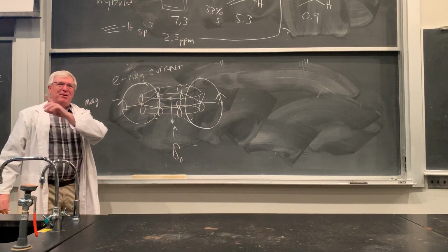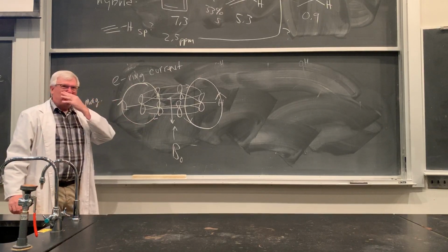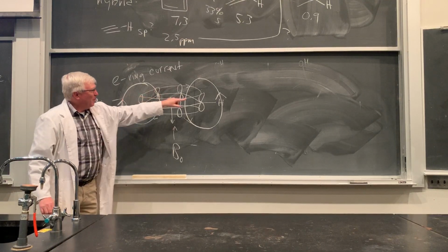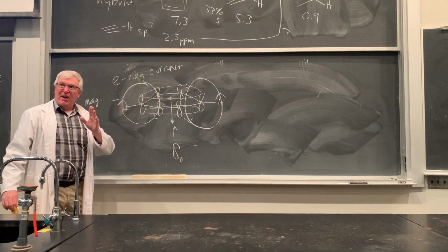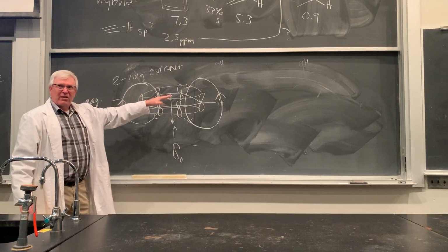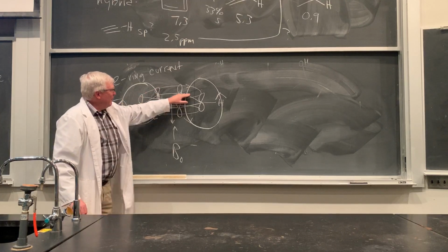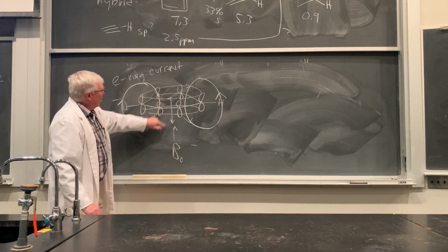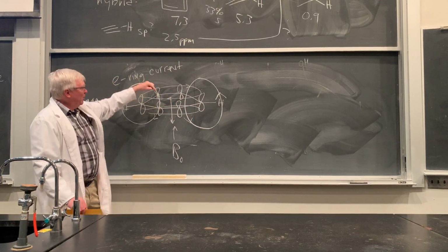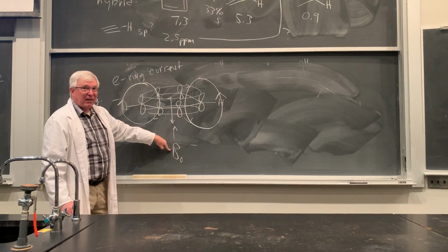I have a better graphic. We'll switch on the graphics in a second. But I think me drawing it kind of shows you the origin of what we're talking about. We have one electrical field. And remember, they always come in pairs. Electrical fields, magnetic fields, they're always perpendicular to each other. This is in a ring, so it's kind of a different shape. We've got a donut shape this way in the plane of the benzene. Then we have these toroidal field lines all the way around, pushing out to try to oppose the large external magnetic field.